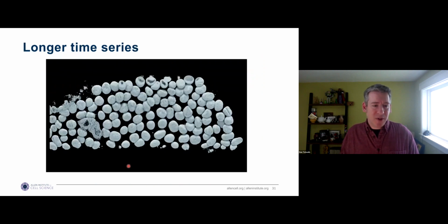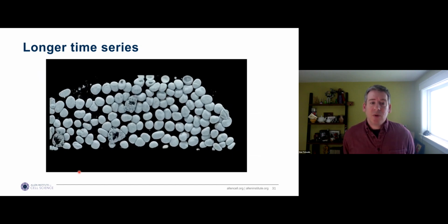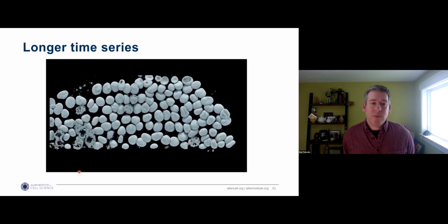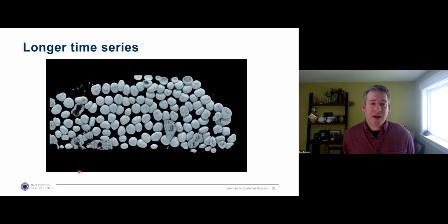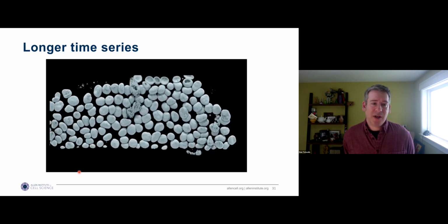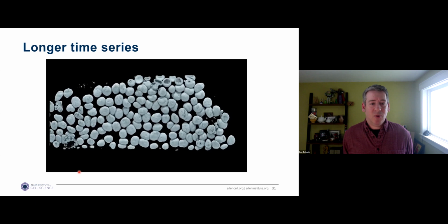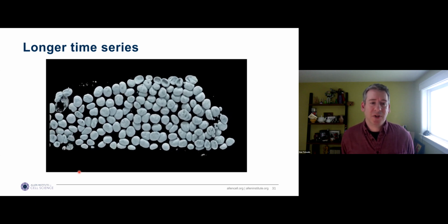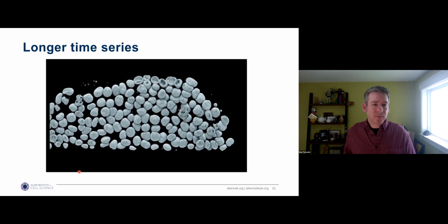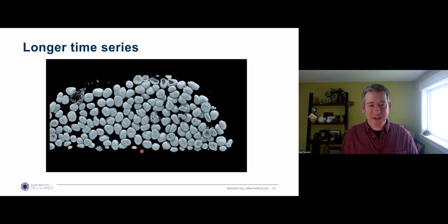And then here's an example of a longer time series that we captured and rendered with Agave. It's kind of subtle here, but the shading and shadows that you see where the nuclei come together are really bringing out the three-dimensionality of this. They make it look less flat and more realistic, and we're getting a true sense of what the shapes of these things really are. And this is just an example of a very long time series.